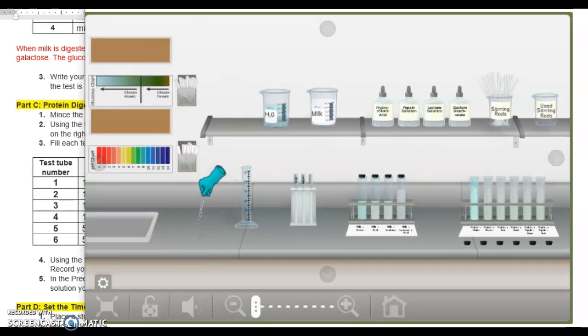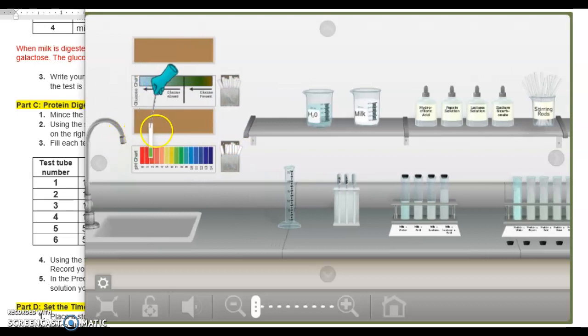You have to pick up the tweezers. A lot of students have a hard time because they don't realize you can't touch the pH strips with your hands. Now, it says that it's green when you start. It didn't already make a test. If you look at this pH chart on the side, green, 7, is neutral. So that's what water ought to be because water is neutral. So I'm going to go ahead and just stick this in the water. Now, you see how the red no sign goes away? It doesn't work until you click it, right? And so it still stayed green because guess what?